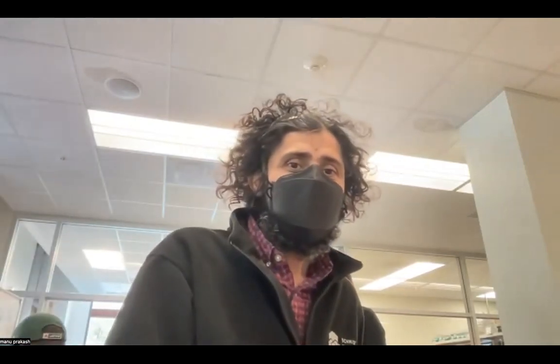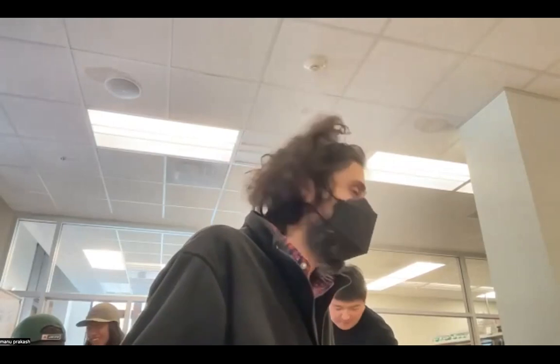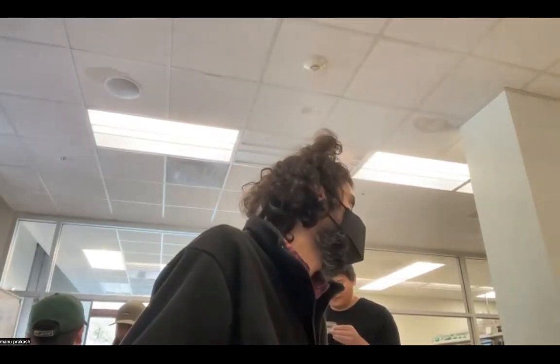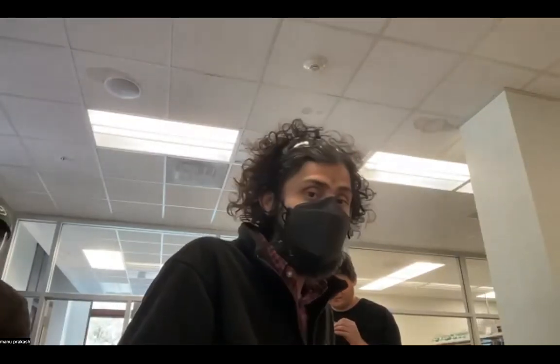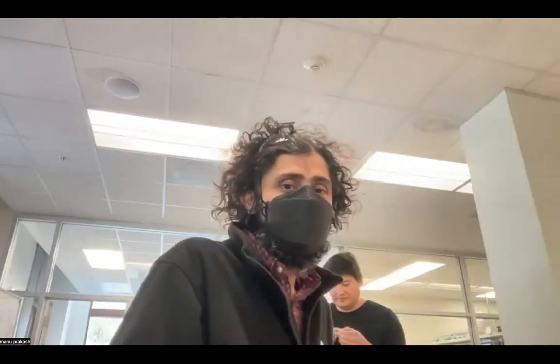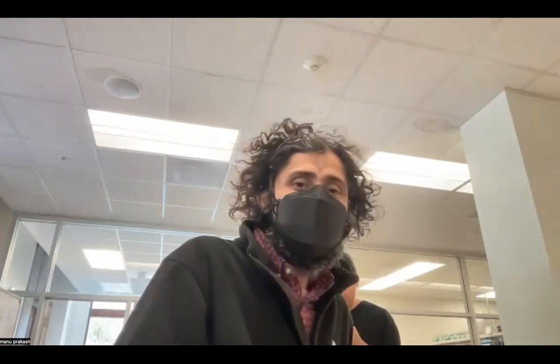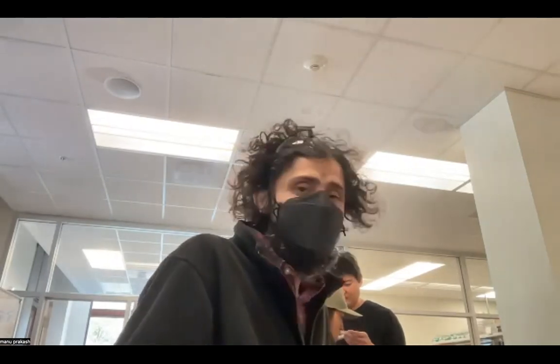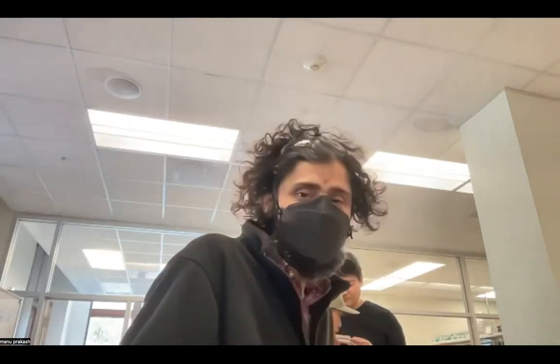So what you can see is we use this framework in design. You always start with what are the minimum requirements that the object should fulfill to meet the criteria that it is going to work for the task at hand. Then there are design parameters. This is the problem really in some sense. This is really the solution side of that story.